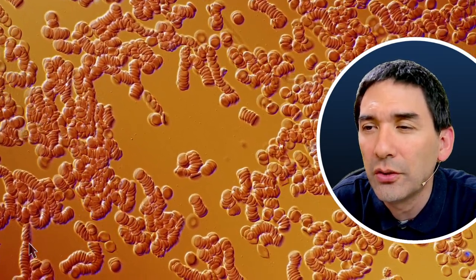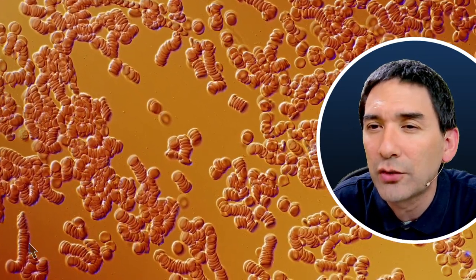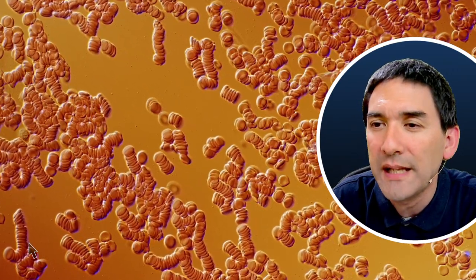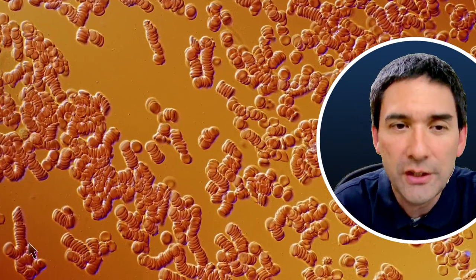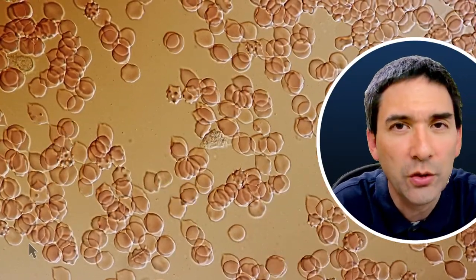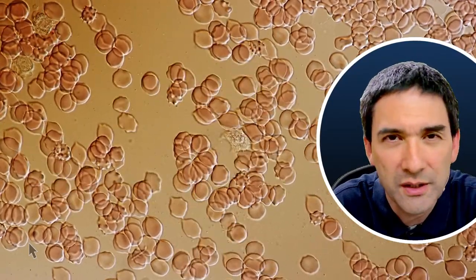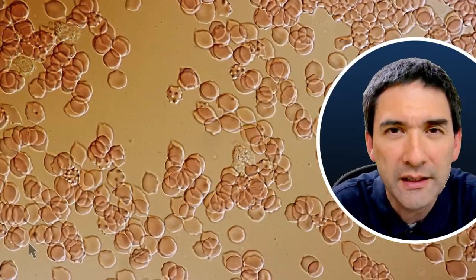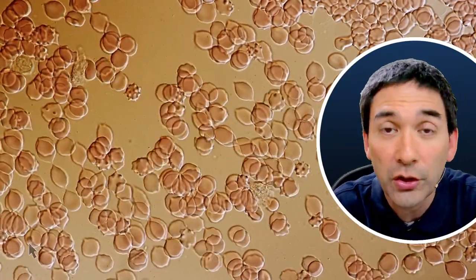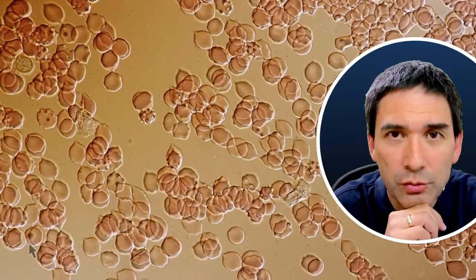Nice. I saw your neutrophil moving around. Next time you may consider to inject some microbes in your blood sample to see how the immune cells are going to act after them. Yes, this is actually quite interesting. I've seen a short video where people introduced, I don't know, was it a tiny worm or so, on the microscope slide, and then you could actually see that after a couple of minutes the white blood cells started to attack that. So this is indeed also something that one might try out.